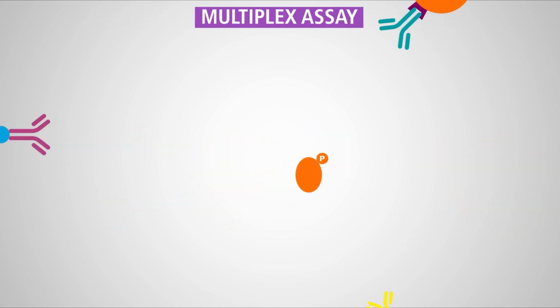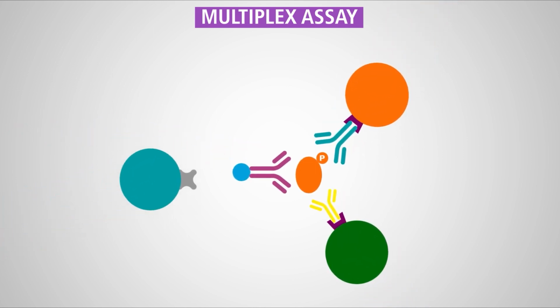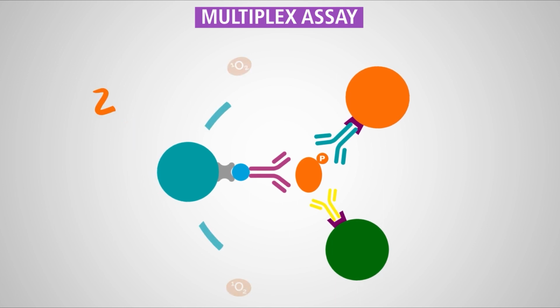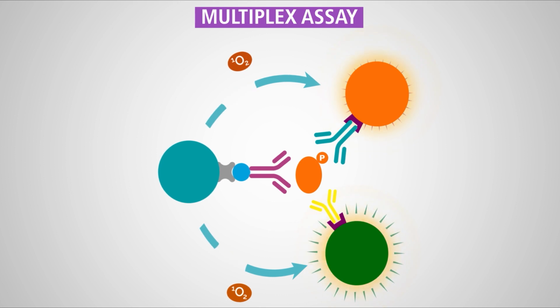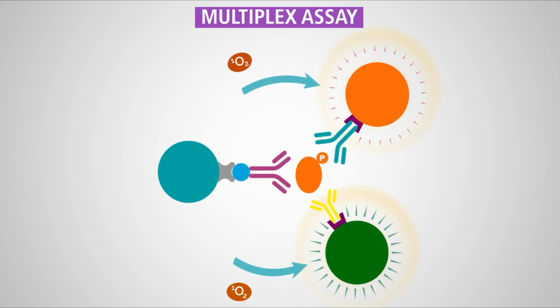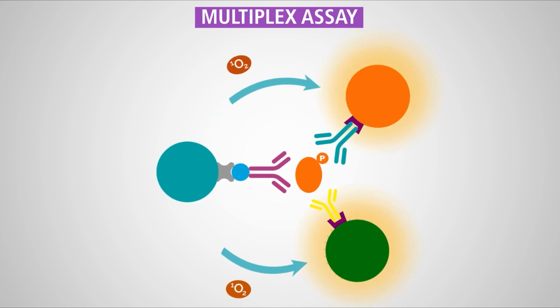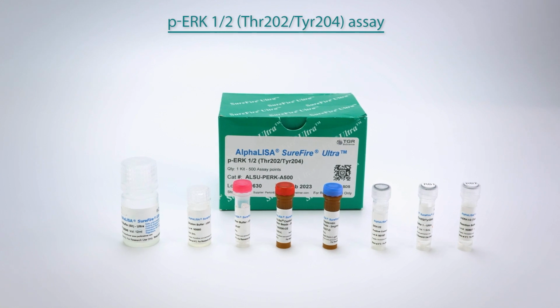A multiplex version of this kit is available in which both total and phosphorylated proteins can be measured from the same well. In that case, two distinct alpha acceptor beads emitting at two different wavelengths report their binding to a distinct antigen through their association with specific assay antibodies. In this video, the P-ERK assay will be used as an example.